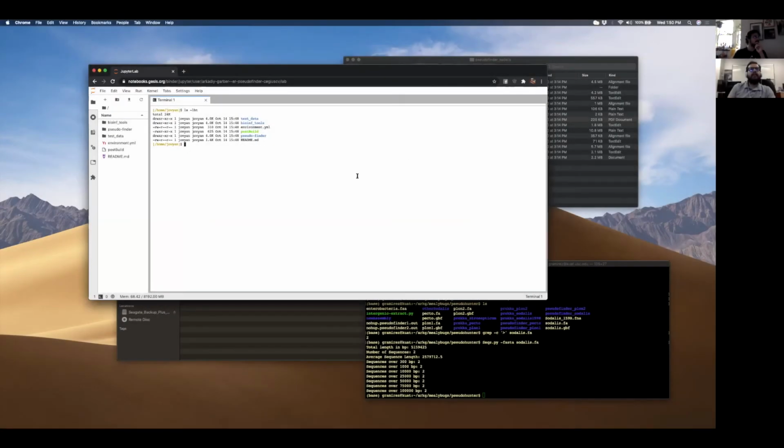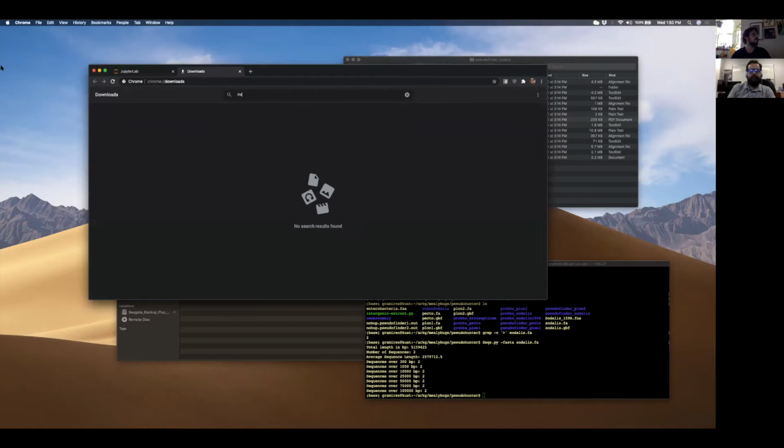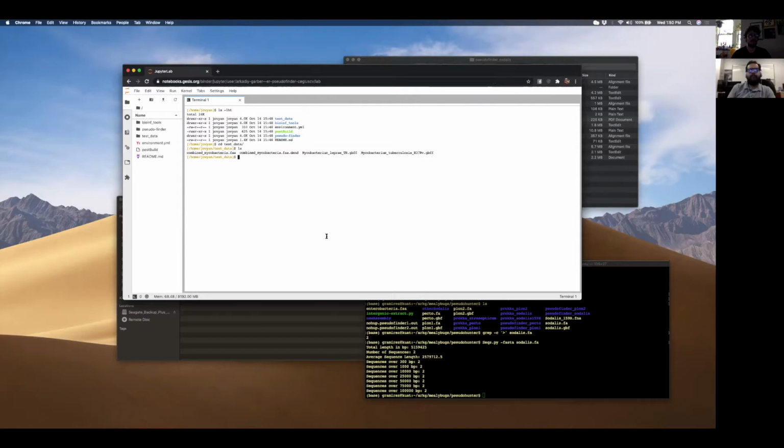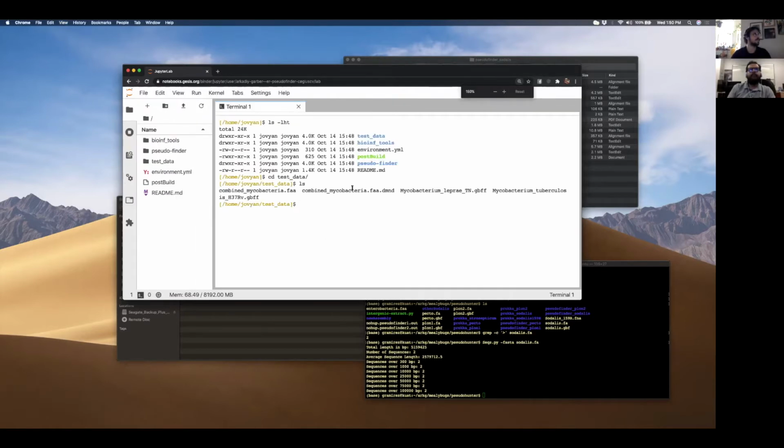Great. So here we have some test data, and let me see. So the test data just basically, oh, that's not what I want to do. Let me actually make this bigger.